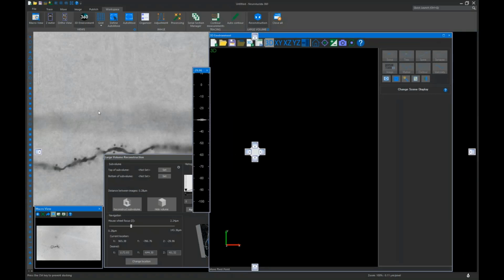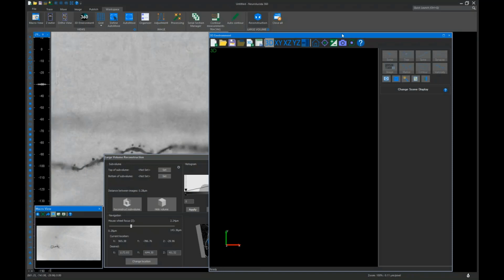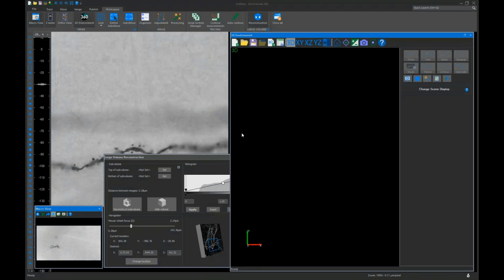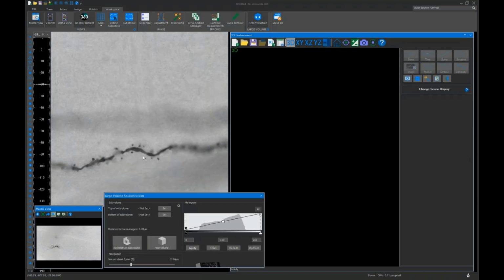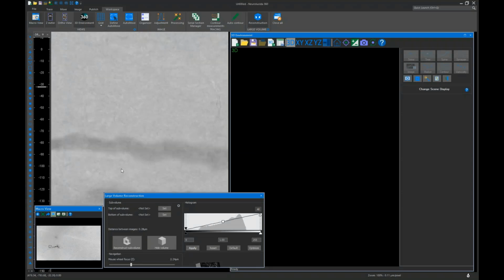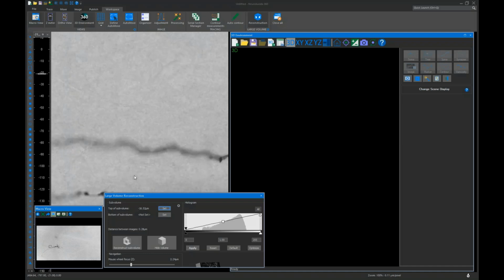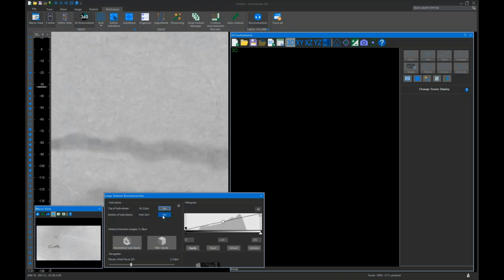And so the macro view is a way to navigate through the entirety of your image with ease. And lastly, the last tool I'm bringing over is our Z meter. And that's going to be how you navigate through the depth of your image in that main view. And so to reconstruct, all you have to do is find an area of interest, use your Z meter and your scroll wheel to find the top of the cell, to find the top of where you want to generate that subvolume from. Click the Set button in this large volume reconstruction window, continue to scroll, and then once that's out of focus, then you can set your bottom.